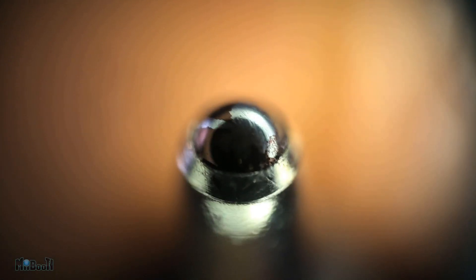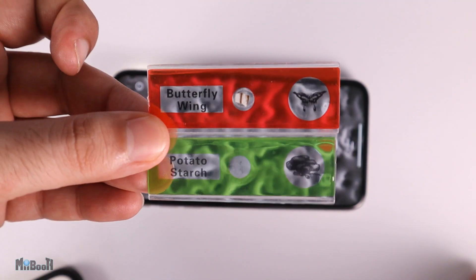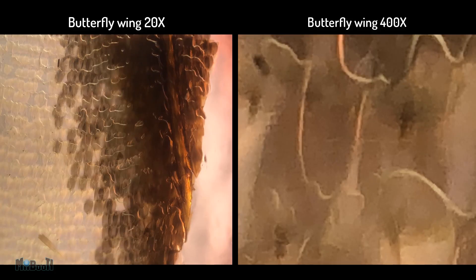Here are a couple more samples. Here is a ballpoint pen tip. And we actually forgot about the slides that came with it — here is potato starch and this is a butterfly wing.